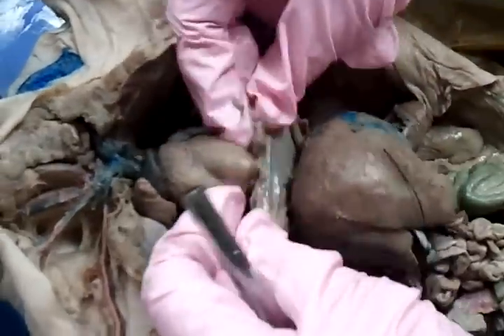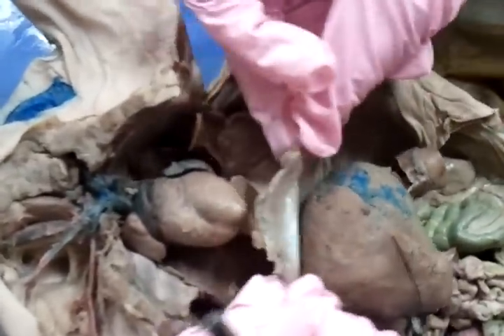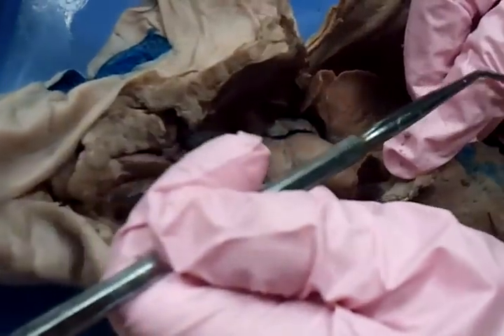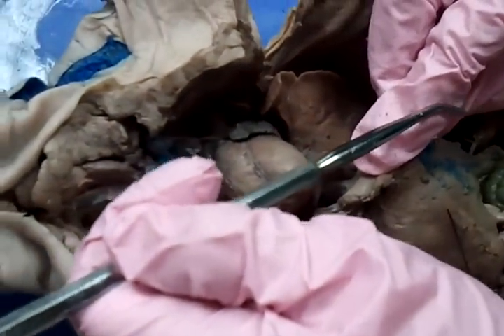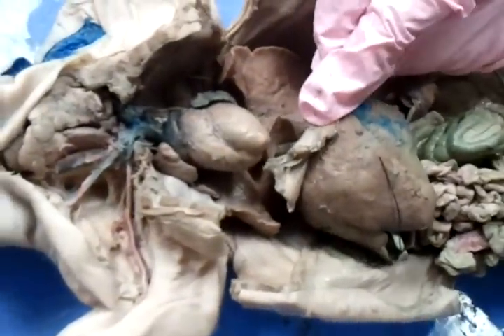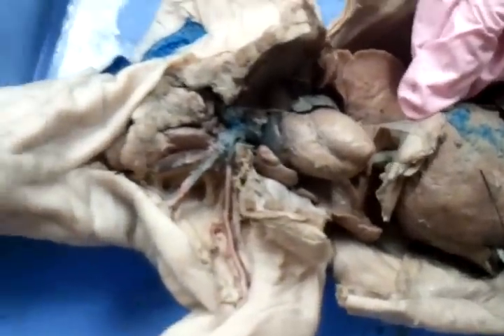All right, so now we're going to everything below the diaphragm, which on this pig they've actually cut the diaphragm well so you can see everything below it. There's the diaphragm. So you had the aortic arch turn and become the descending aorta. In the thorax, it's called the descending thoracic aorta. Once it passes through the diaphragm, it's called the descending abdominal aorta.